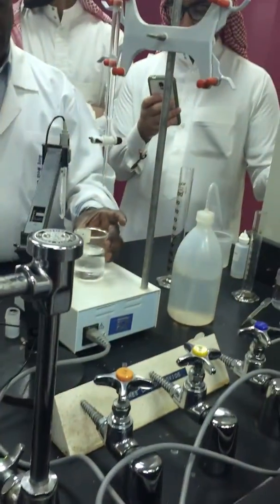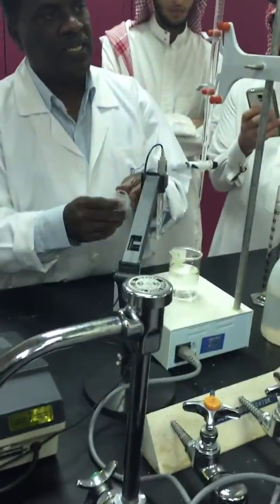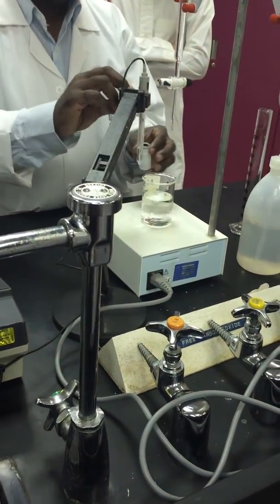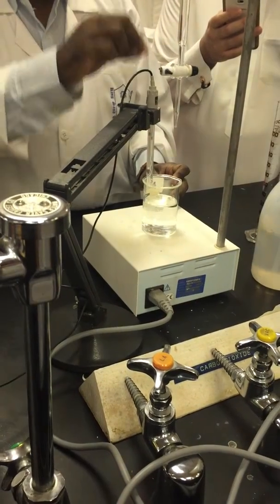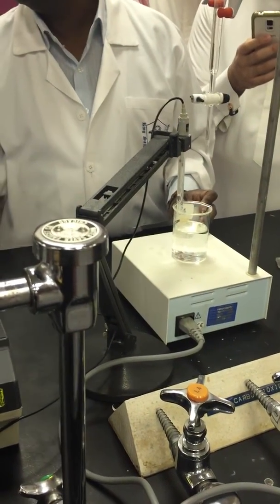Okay, 100 milli. Then see, this is where the electrode is. This is the solution to keep the electrode in. I have seen many students in the exam trying to take the pH with this still on. No result, the pH is not changing. He's adding sample, he's adding acid, and the pH does not change. Why?